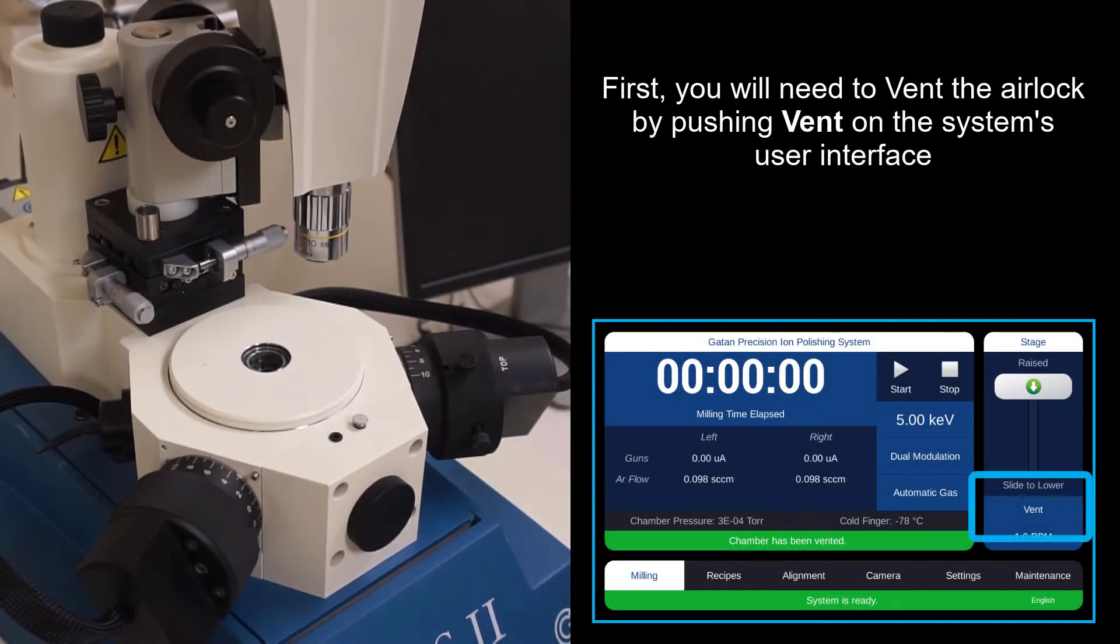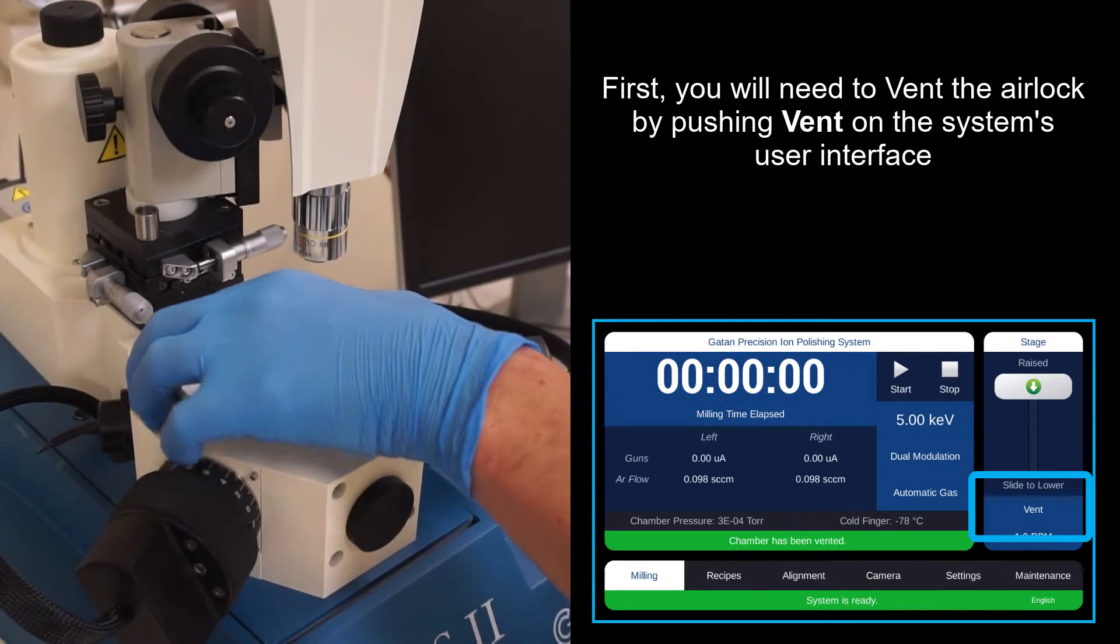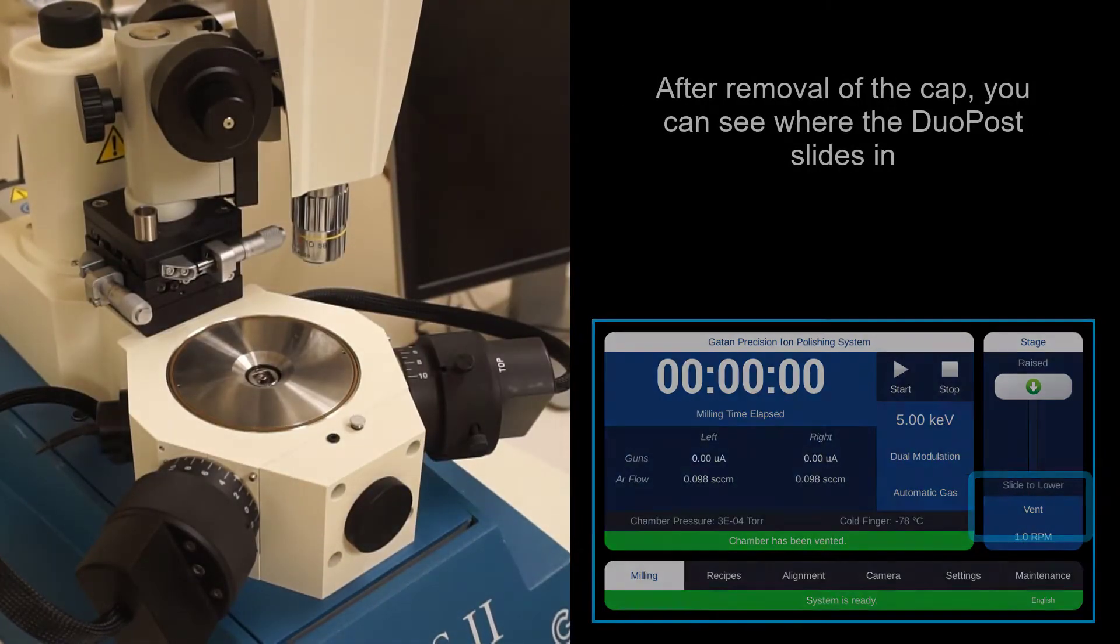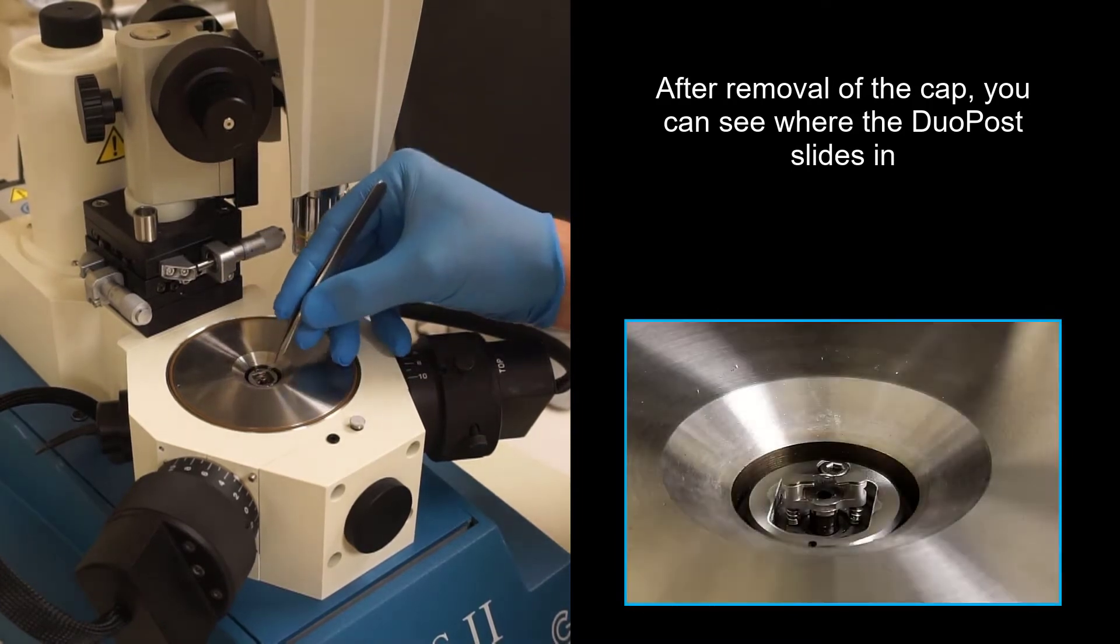Okay, first up you will want to vent the airlock. Press the button on the face and lift this. Now we see where the DuoPost slides into here.